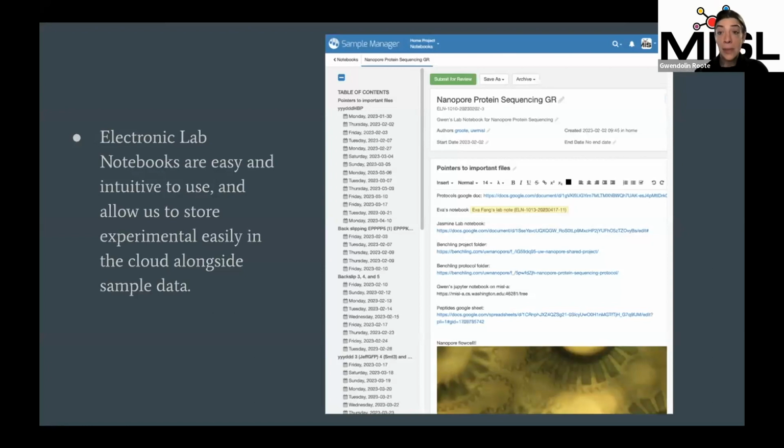So you can make as many notebooks as you want in the software. Entries can be broken up into, I use the entry to have like a specific type of thing. So I have one notebook for this protein sequencing project, and I have entries for each of the proteins that I am constructing, and then I can break it up into days for all the steps that I do to make a protein.